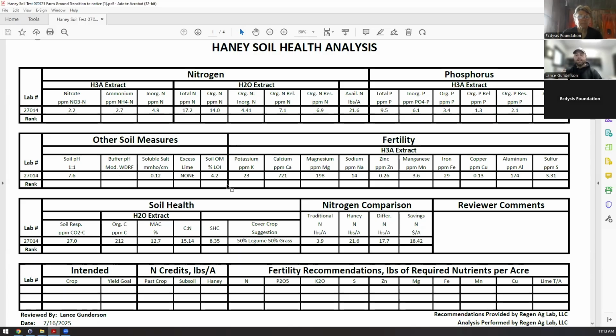50 to 80 is kind of ideal in that the microbes are eating at a rate at which the system is supplying carbon. And when I say the system, I mean photosynthesis from your living crops, compost additions, manure additions, cycling of residues at the surface that all feed back into this pool of carbon. So think of it like a battery. I'm charging the battery at roughly the same rate I'm using the battery.